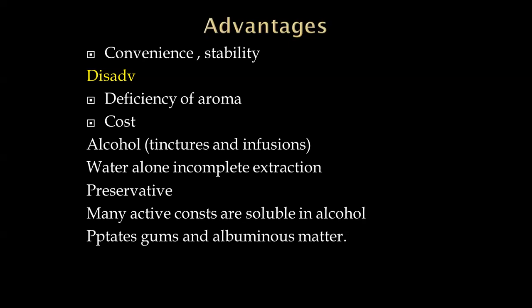When you go for extraction with gum and albuminous matter, there is a possibility you can find some precipitate. In that case, you have to go for filtration.